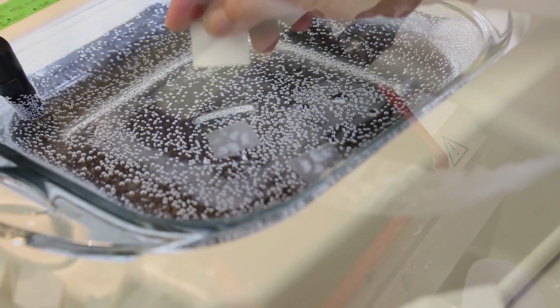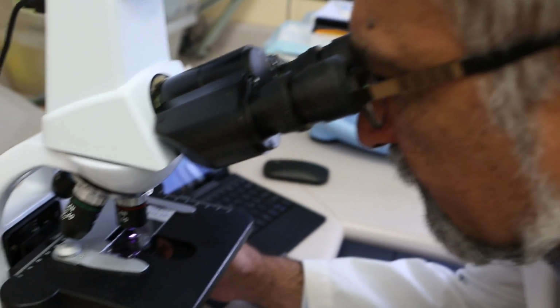This machine allows us to preserve the brain tissue in its natural state. And not only that, we are now able to cut these brain tissues very thin. 5 micron. What's 5 micron? It's smaller than the diameter of a hair. Very thin. And you can imagine, these brain cells are very, very small. And so when we are able to safely, properly cut these, we are now able to stain them with more different reagents, more sophisticated reagents to understand what is going on in the brains of individuals with Alzheimer's disease.